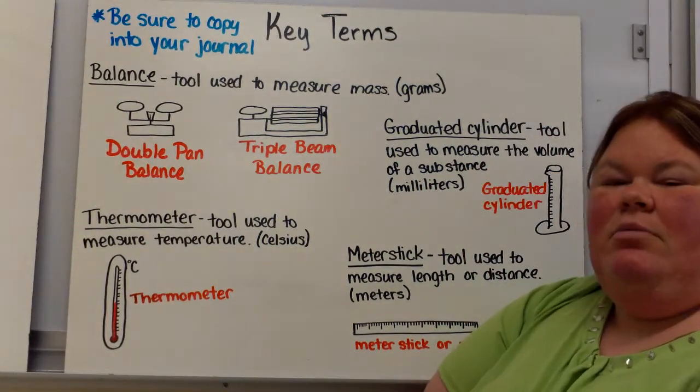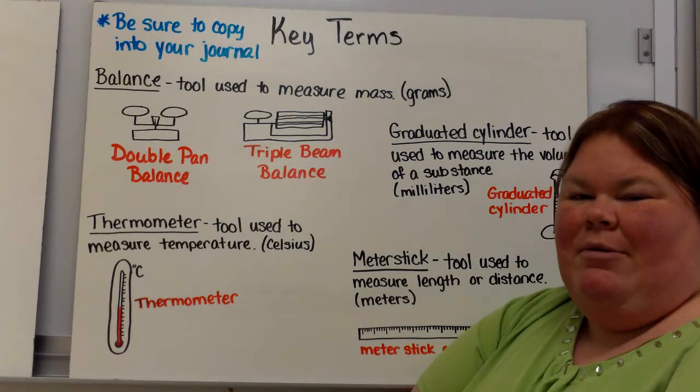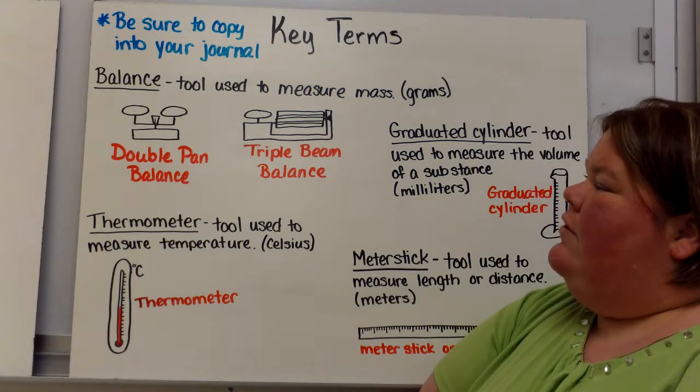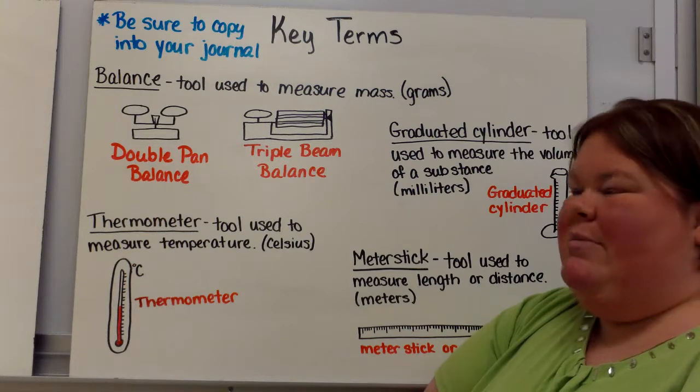Here are some key terms that you will need in order to learn about lab equipment. Make sure that you copy these down into your journal. These are different tools that we use throughout the lab and when we do lab studies.